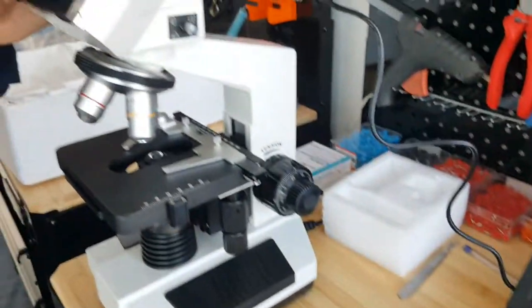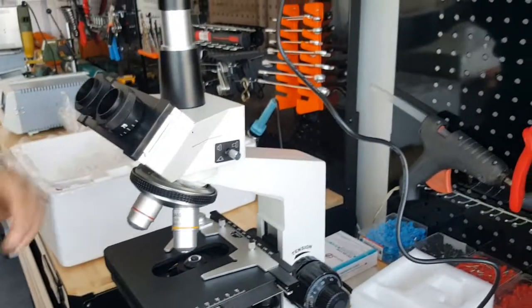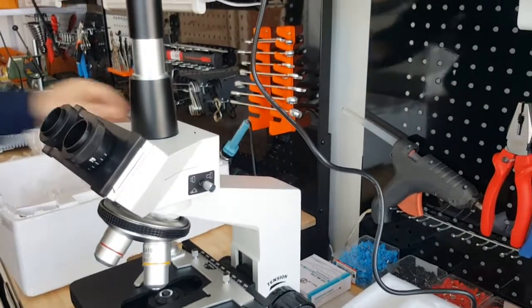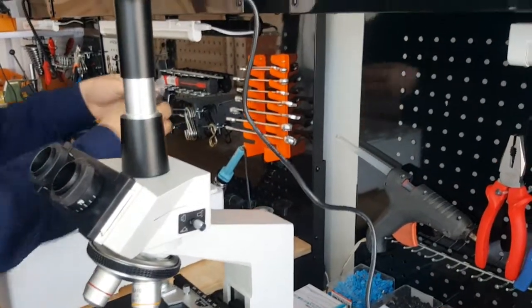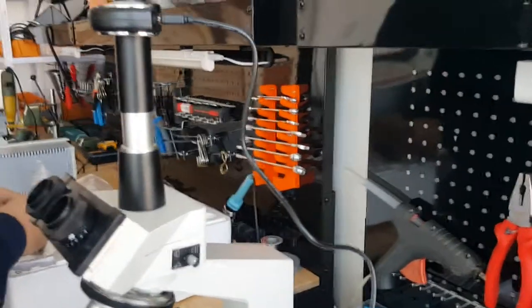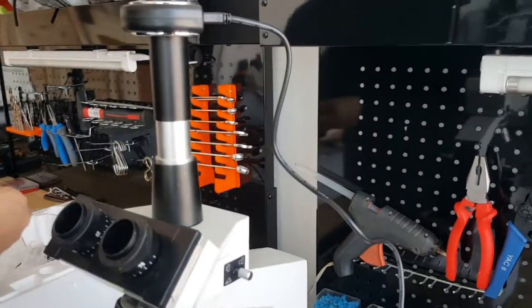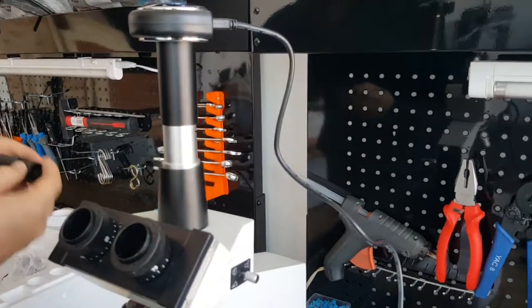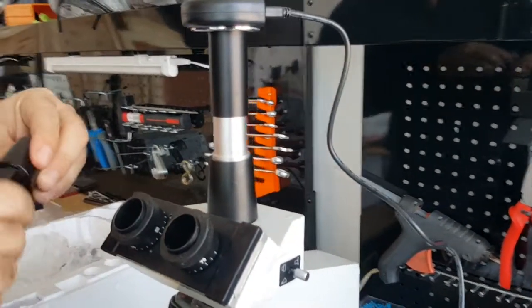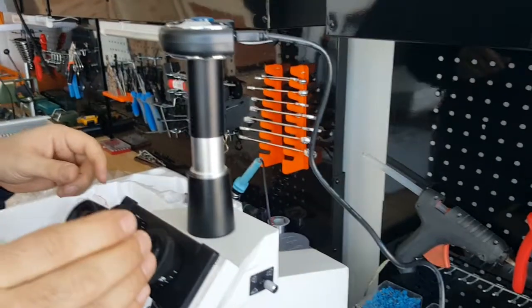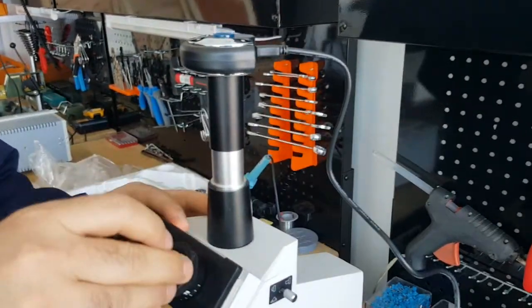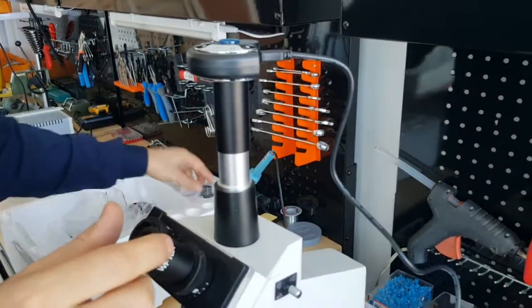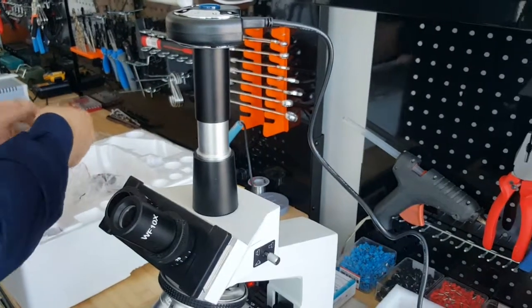After the assembly of the microscope itself is done, we also have two eyepieces that will be coming here. Both are with magnification of 10.